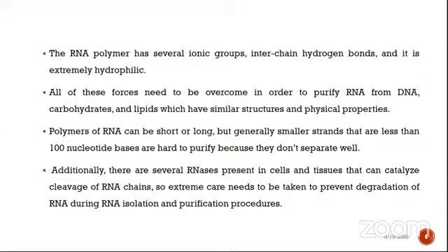The RNA polymers are of different lengths, short or long. But the purification of shorter stretches of RNA, those less than 100 nucleotides, is harder because they do not separate well.